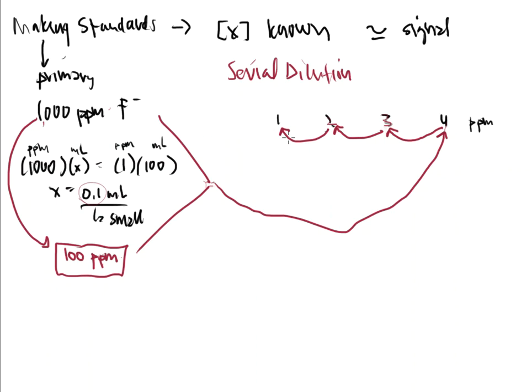And you never want to do them. And this is why. Let's say that you made a mistake in your math. And when you figured out your numbers to make the 4 part per million, you miscalculated.